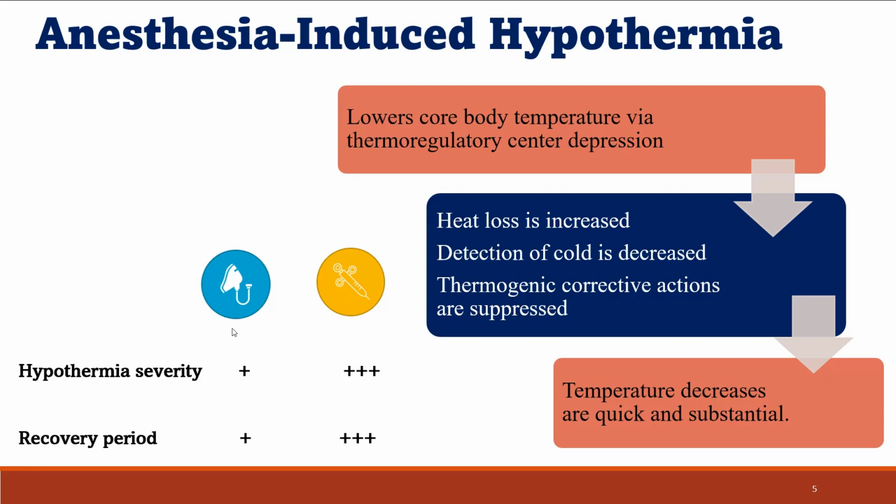All these three factors result in a quick and substantial loss of body heat and thus a drop in body temperature. Moving on to the comparison of inhalant versus injectable anesthetics. When we compare these two, injectable anesthetics expose the animal to a much more severe hypothermia, and that's why the recovery period with injectable anesthetics is also pretty prolonged.